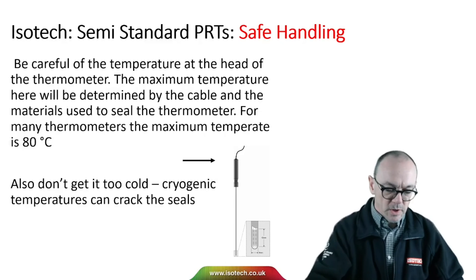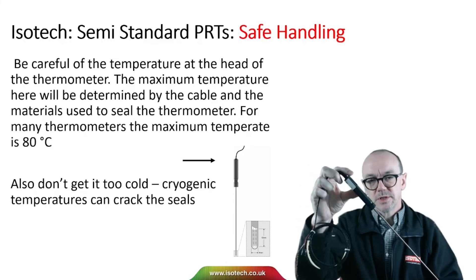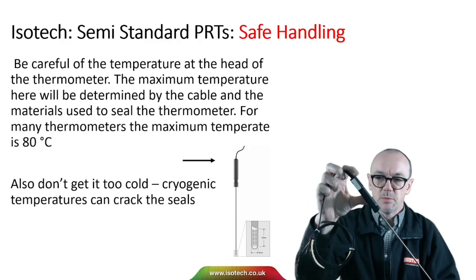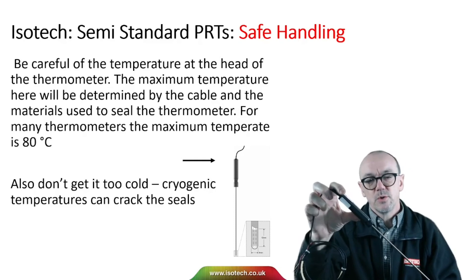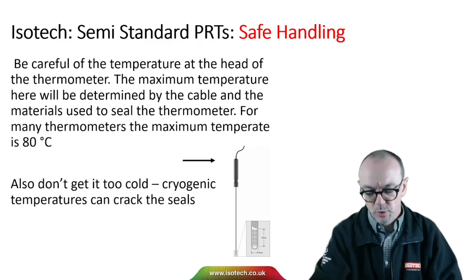Be careful at the head of the thermometer if there's a handle or other termination point. The materials used here won't necessarily be rated for the whole temperature range. For many thermometers, the handle part needs to be kept below about 80 degrees C. Equally, cryogenic temperatures can crack the seals and damage the thermometer, potentially allowing moisture to enter.